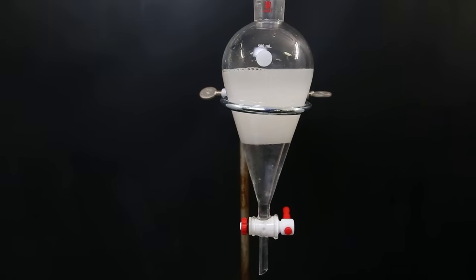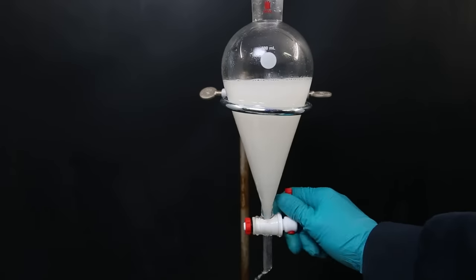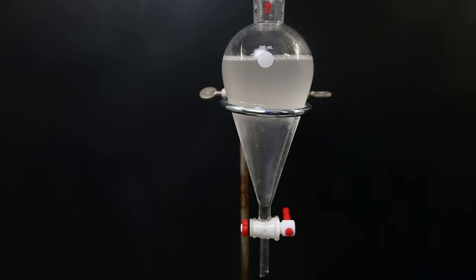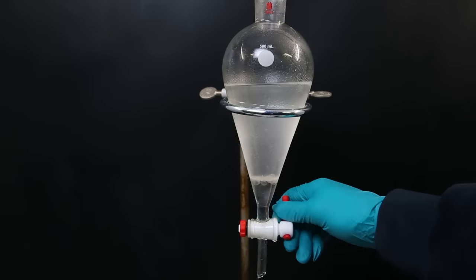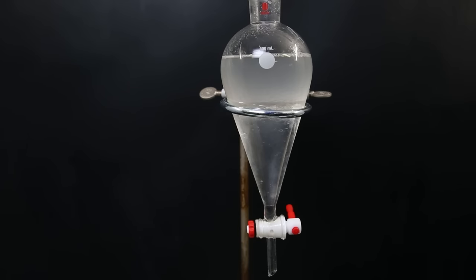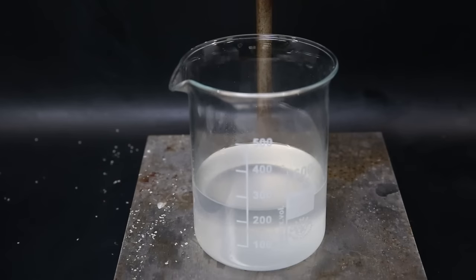I then poured the organic layer back into the separatory funnel and washed it once with water, once with a saturated sodium bicarbonate solution, and once with a saturated sodium chloride solution. I then take the washed organic layer and add a bunch of sodium sulfate to dry it.